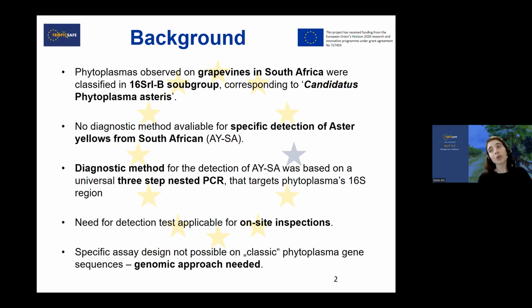However, the situation was a bit complicated, because specific assay design was not possible on classic phytoplasma gene sequences that are normally used for detection of phytoplasma. So there was a need for a novel approach, the genomic approach.